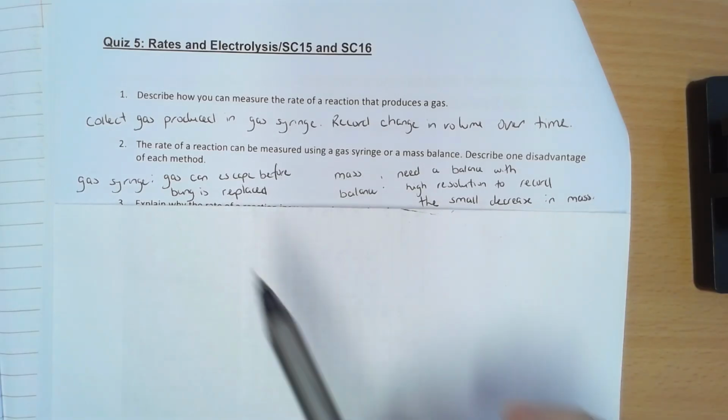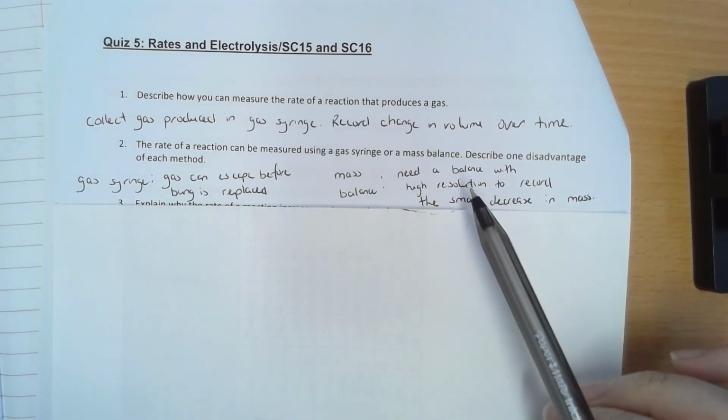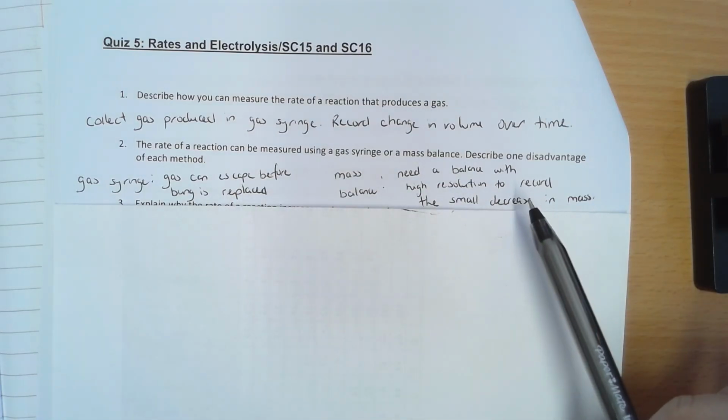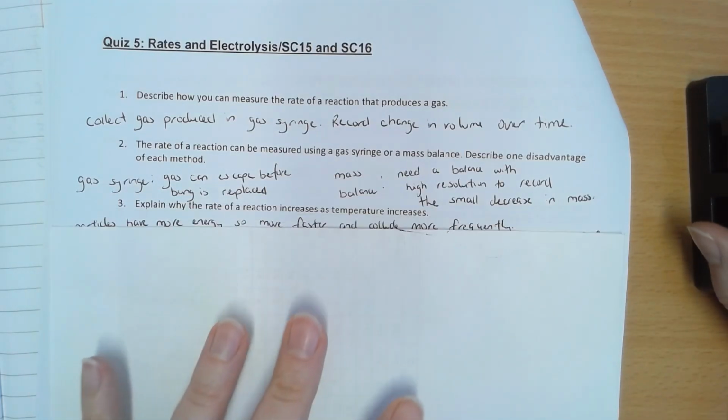Disadvantage of each method: gas syringe, some of the gas can escape before you get that bung on. And mass balance, because the decrease will be so small, you just need a very sensitive balance, a balance with a high resolution, or you're not going to be able to record your results.